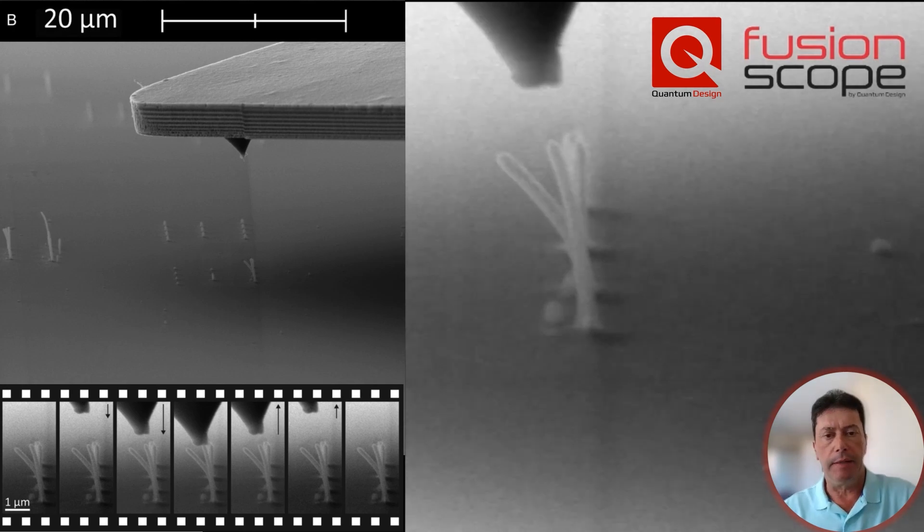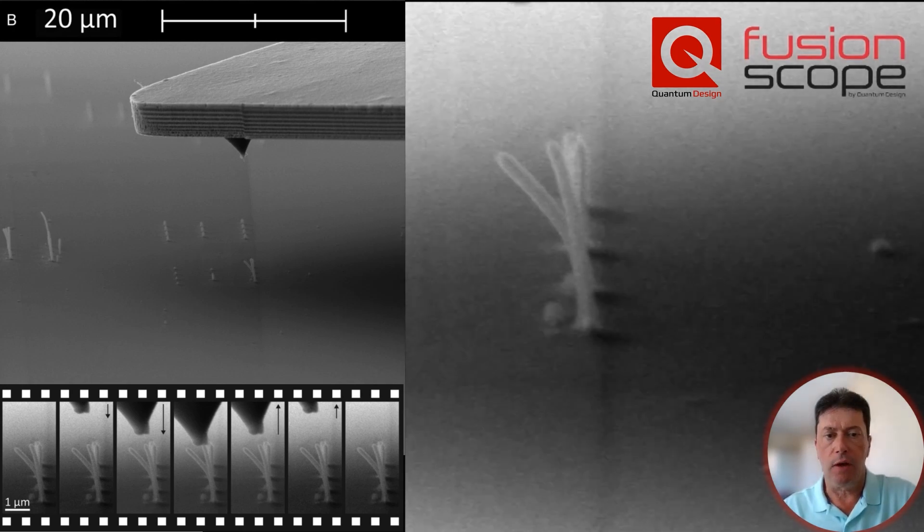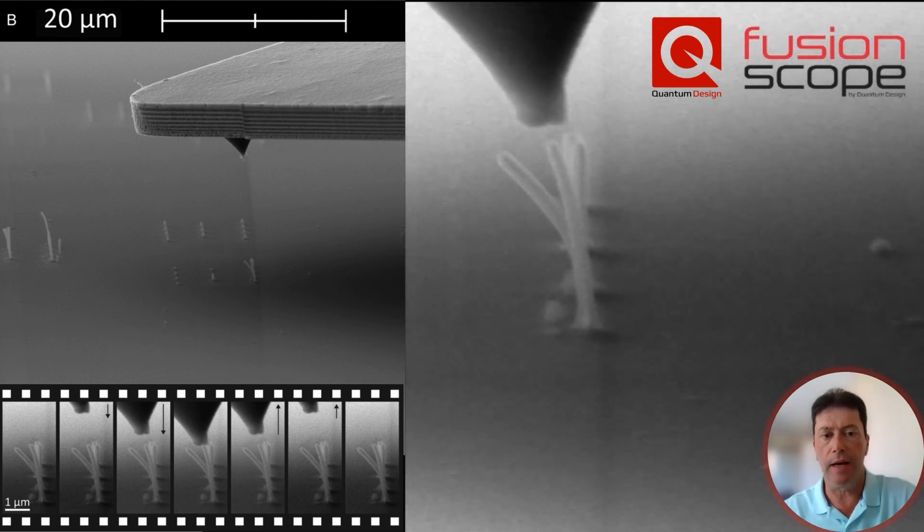In this experiment, we measured the spring constant of a 3D nanostructure with outer diameter dimensions in the range of a few hundred nanometers.